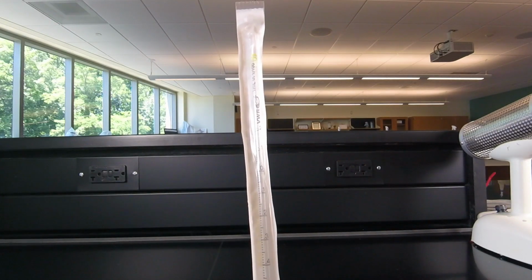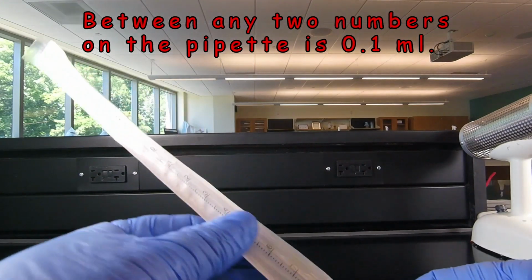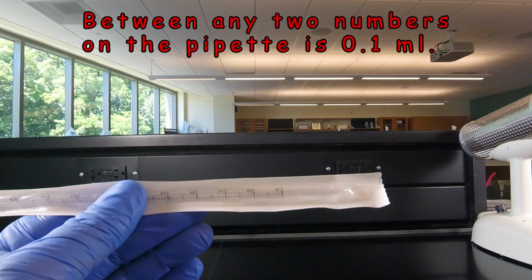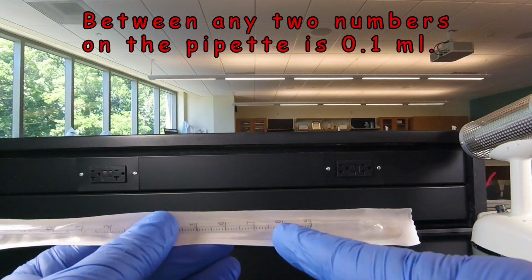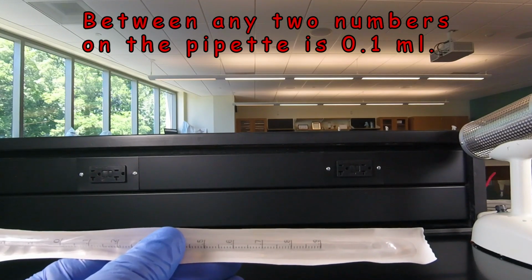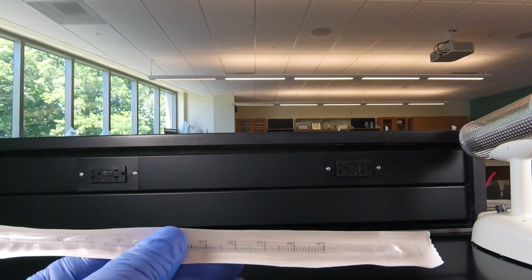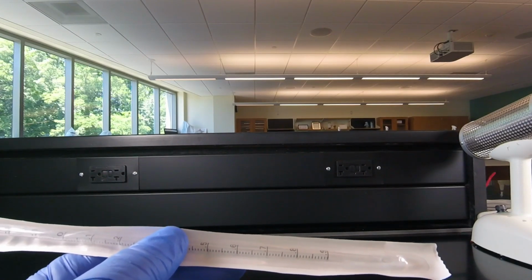If we want to put a tenth of a milliliter onto a petri plate, then we're going to use just a tenth of a mil. That could be from the tip to 0.9, or 0.9 to 0.8, or 0.8 to 0.7. Again, between any two numbers is 1/10 of a milliliter. So it's very important you know how to read the pipette first.